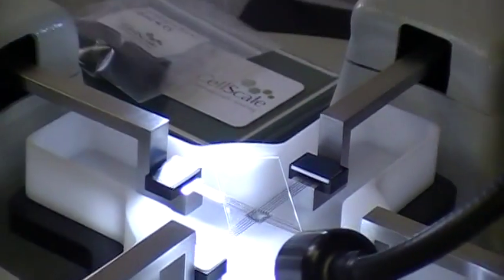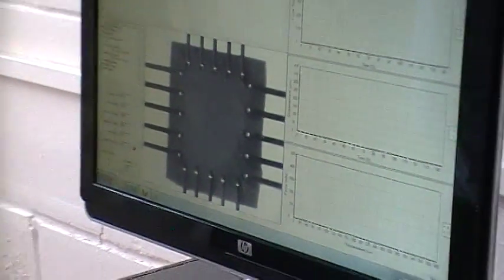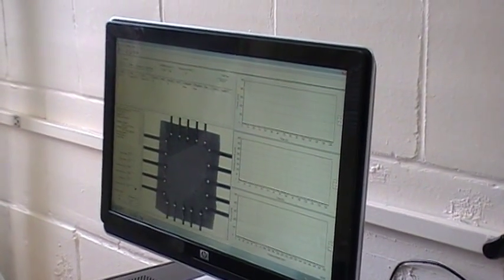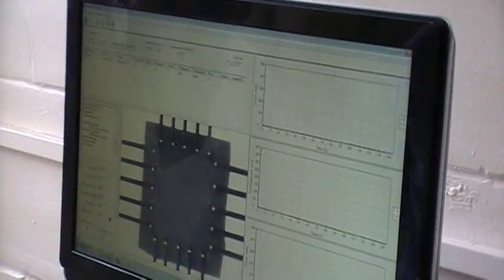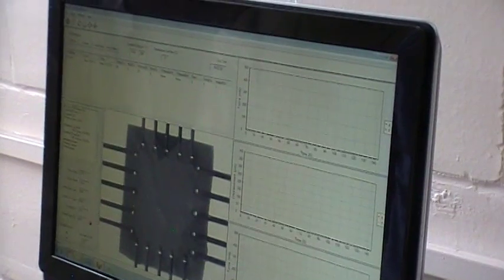Gain at all? I think the brightness is just about right. I think the focus looks fine. All right, so we would go in after this to set up the test. Sure. And if you needed to make changes to the camera gain, that would be under tools, hardware, or settings, hardware rather.